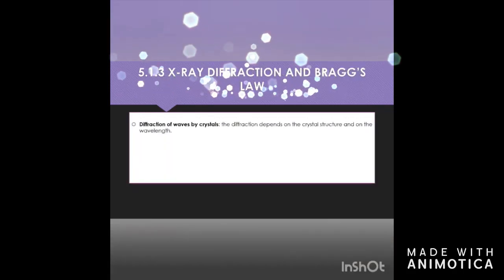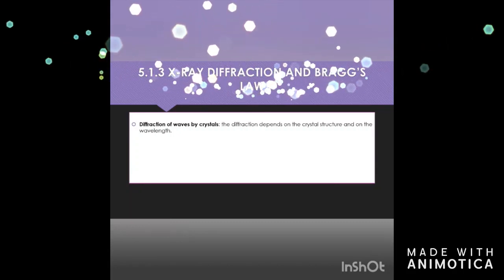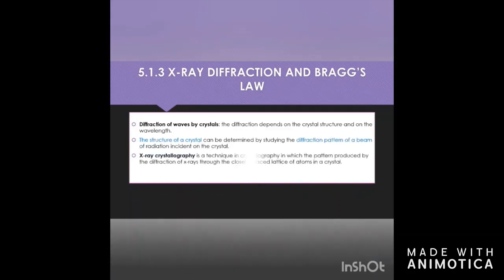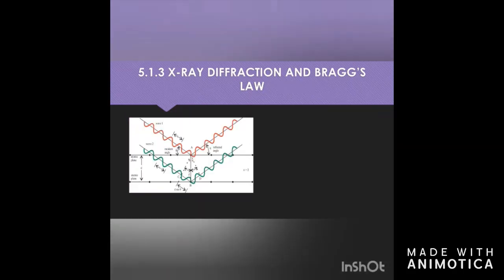X-ray diffraction and Bragg's law. Diffraction of waves by a crystal depends on the crystal structure and on the wavelength. The structure of a crystal can be determined by studying the diffraction pattern of a beam of radiation incident on the crystal.